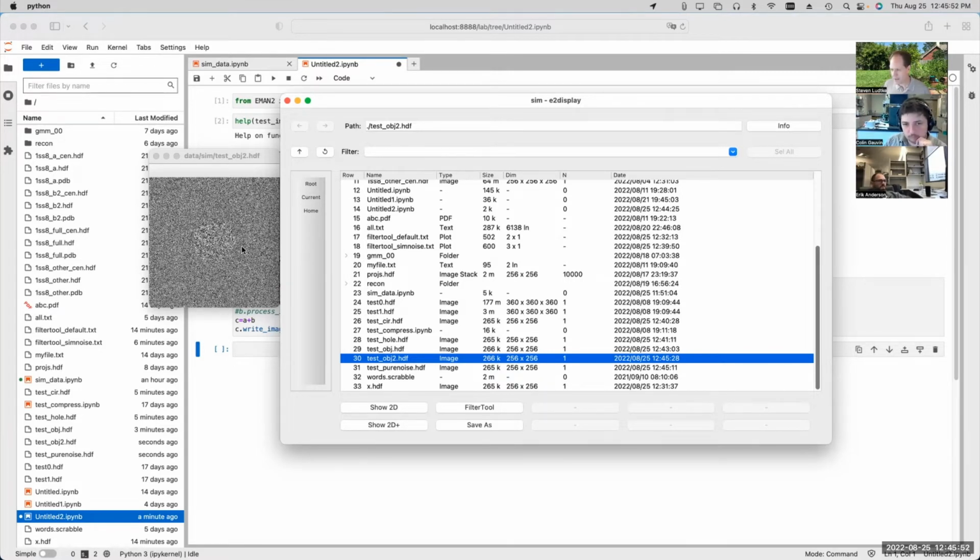Now, it depends a little bit on what you're trying to simulate in a certain sense, right? If you're thinking about, say, a vesicle in solution that's floating around, or a protein in solution, then where the protein is, it's excluding the solvent, right? So you don't want to have the solvent noise where you have the structured particle data.